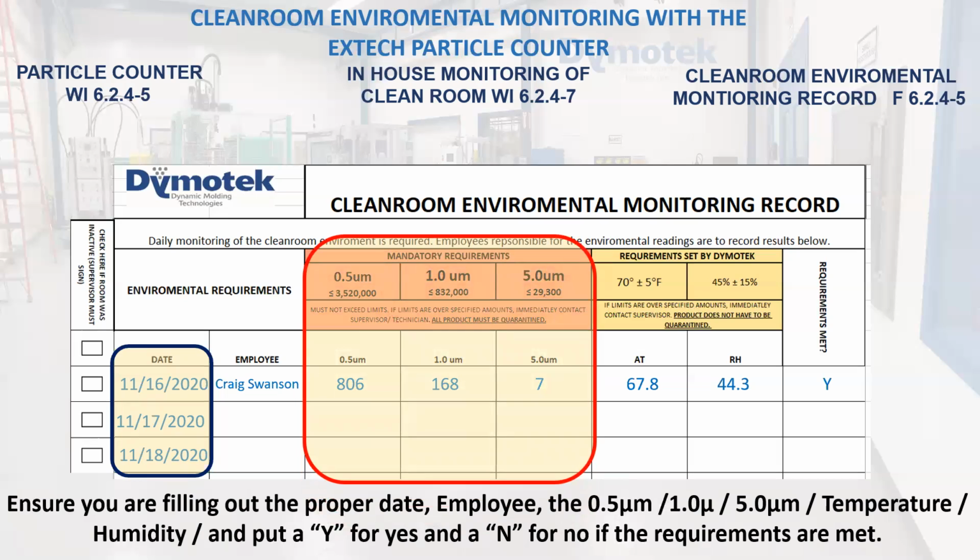Mandatory requirements for the particle count, as we had previously gone over: you will see that for 0.5 microns, you cannot have anything more than 3,520,000. The 1 micron, 832,000, and the 5 micron, 29,300. Ensure the numbers you just logged in the corresponding boxes below do not exceed any of these numbers. If they exceed these numbers, you must immediately contact your supervisor and/or technician.